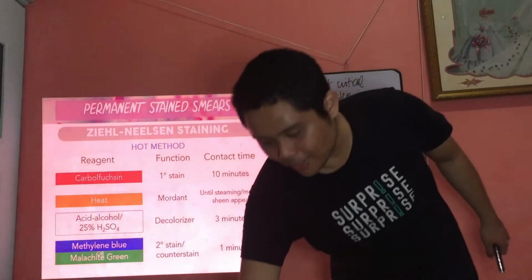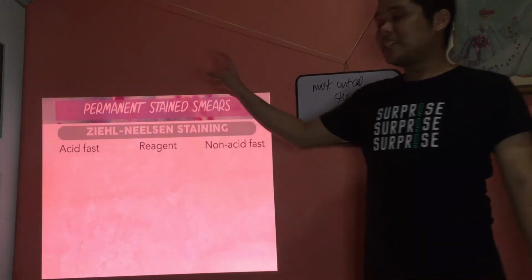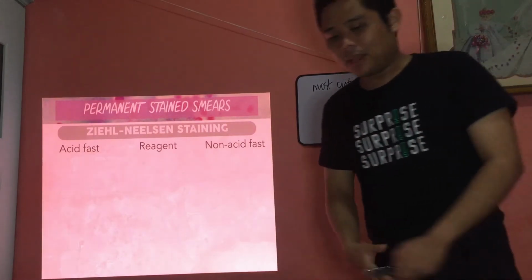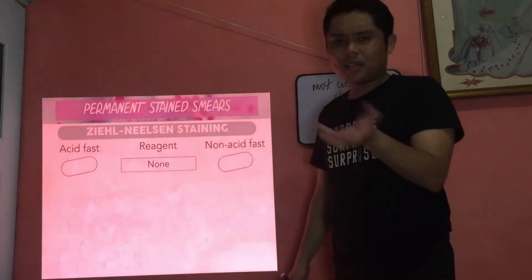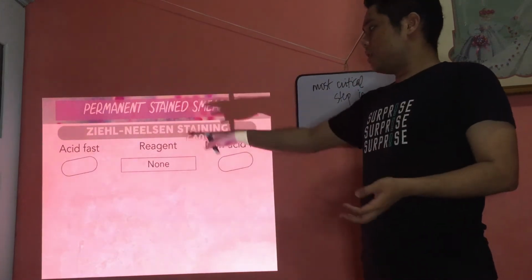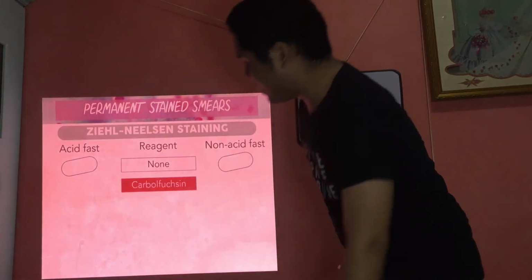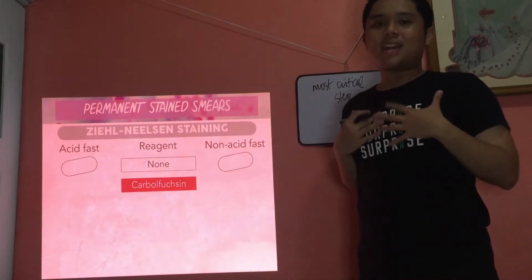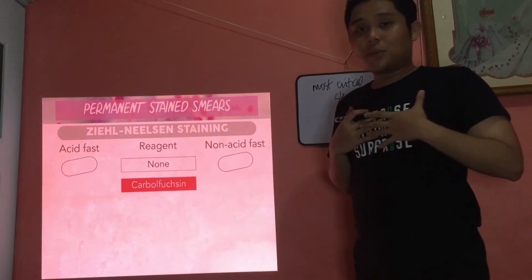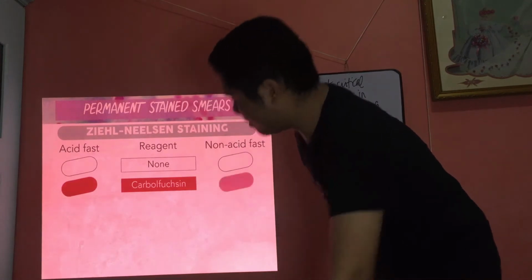So we have a diagram. So as you can see now, let's say we have the reagent and let's say an acid-fast organism and non-acid-fast organism. So let's say your organism, of course, reagent is wala. You did not apply any reagent pa. So of course, the organism is not colored. Okay. Next, we then add carbofuchsin. Ayan. So what do you think will be the color of the two? Wala pa may decolorizer, wala pa anything. So what's the color? Of course, they will take up the color of carbofuchsin, which is red, both of them.